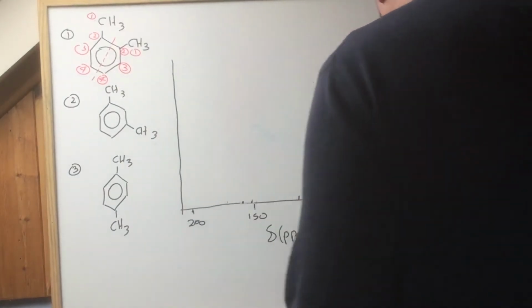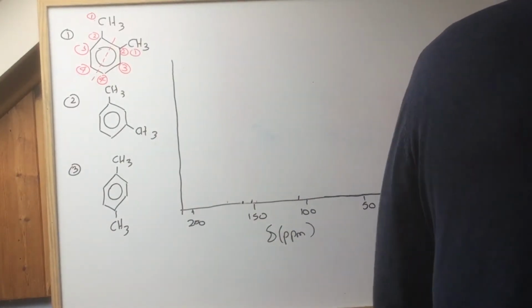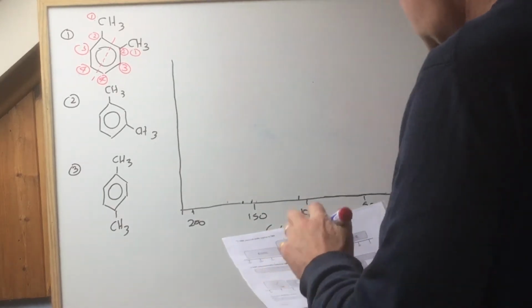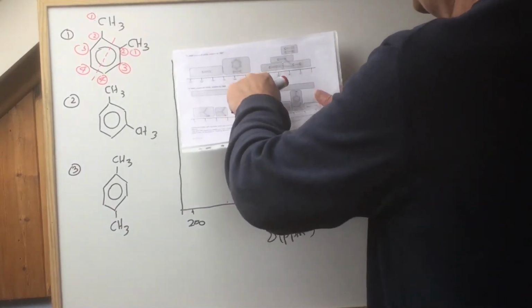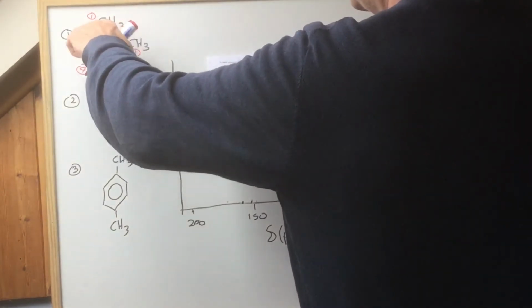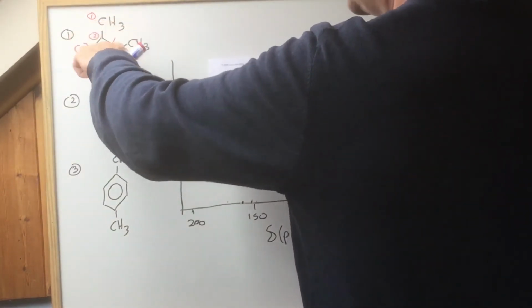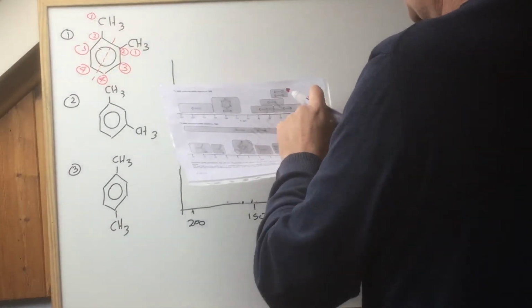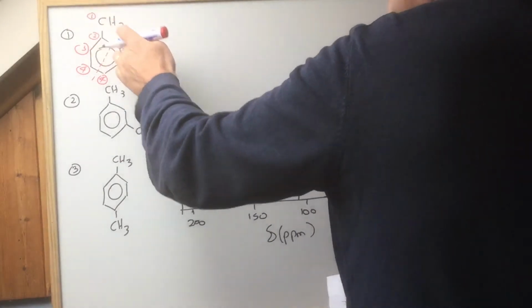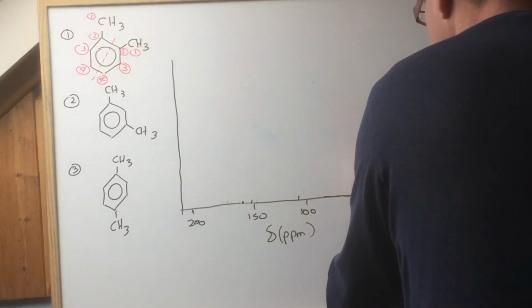So in other words, I get my chemical shifts right, as I keep saying, because I haven't altered the scale to make it easier. Those are not in that region, because they're just carbons outside, between 0 and 50.